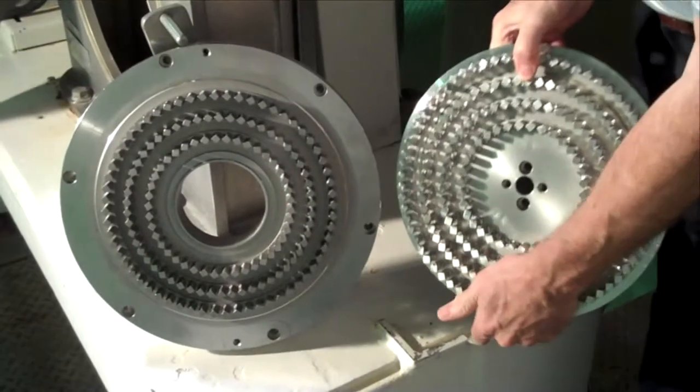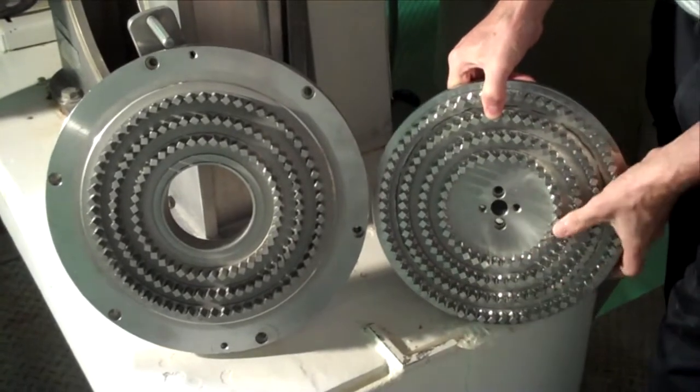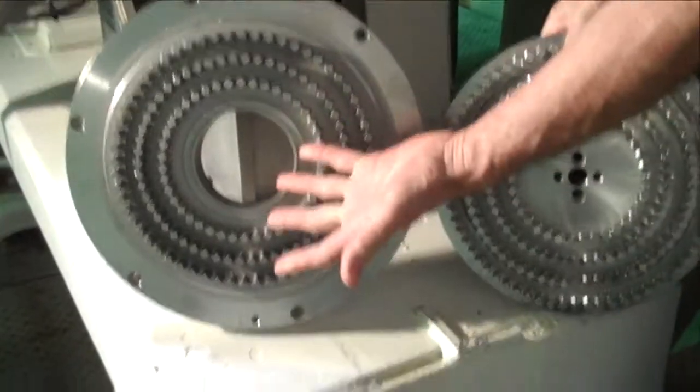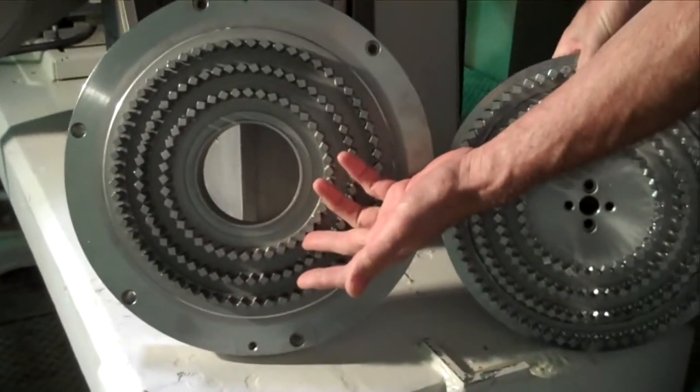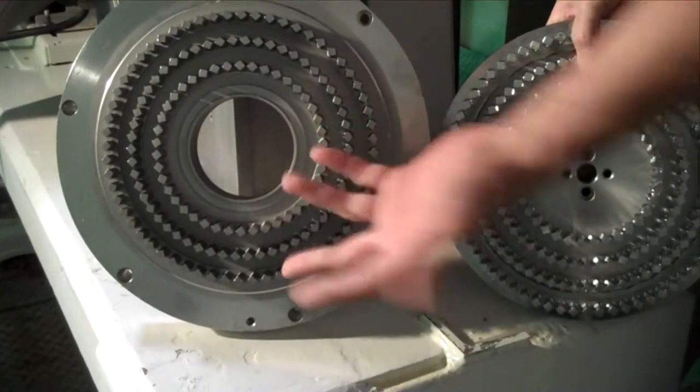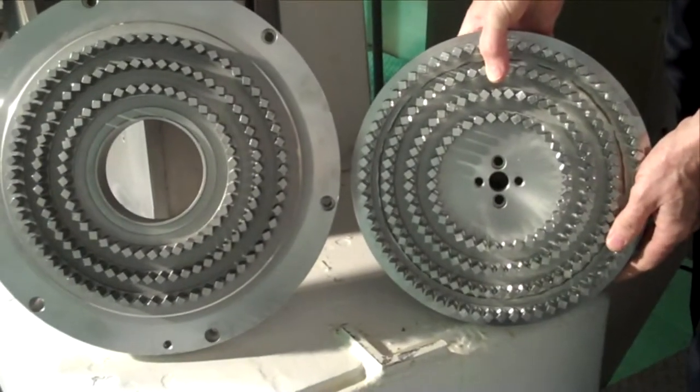The first example of interchangeable grinding media is the pin disc arrangement. Here we have the fixed stator mounted on the door and here we have the rotor which connects to the main drive.